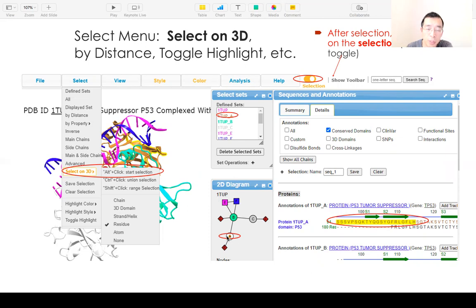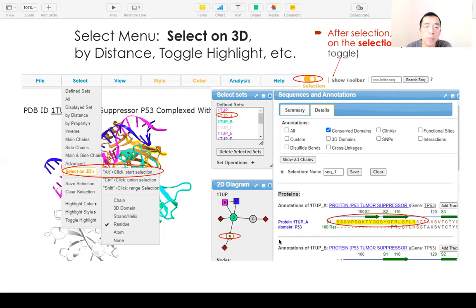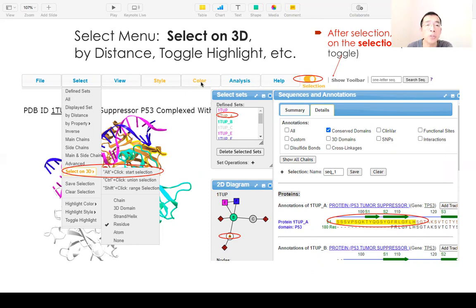The selection will also show up in the 2D diagram and in the 1D sequence. And if you select in the 1D sequence, the selection will show up in 2D and 3D as well. After the selection, the toggle shows the selection and the color becomes orange. The style and color menus also become orange, meaning all your actions will only apply to your selection.